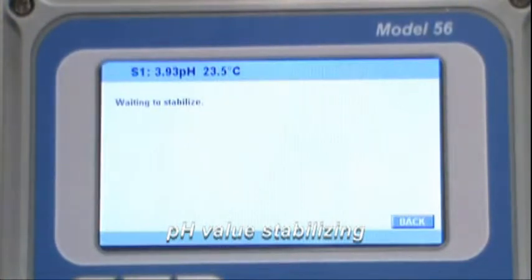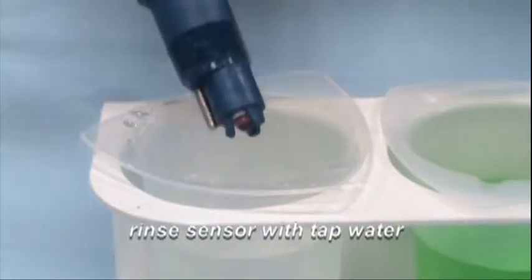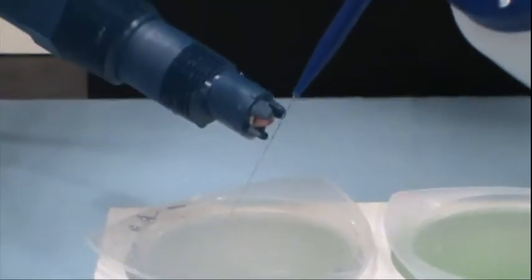Once the buffer value has been acknowledged by the instrument, remove the sensor from the pH 4 buffer solution. Rinse the sensor in the rinse beaker.